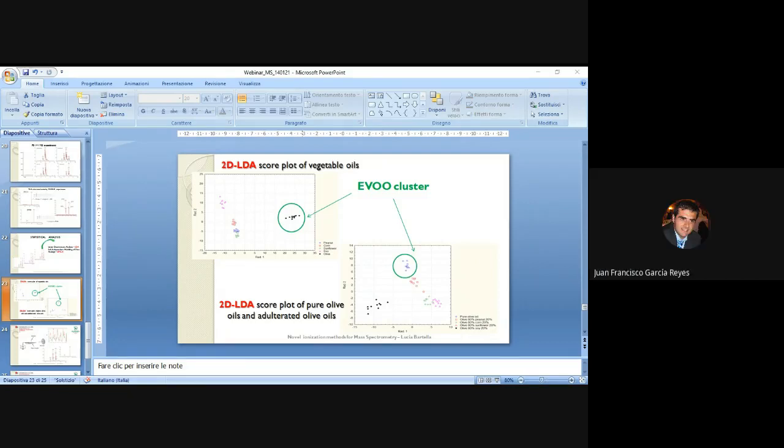Any more questions? I have also a question. Odysseus, go ahead. Congratulations for the presentation. Thank you. I have a question about the linear discriminant analysis. As I see, your spectra are normalized to 100%, and the shape is similar in most of the cases.